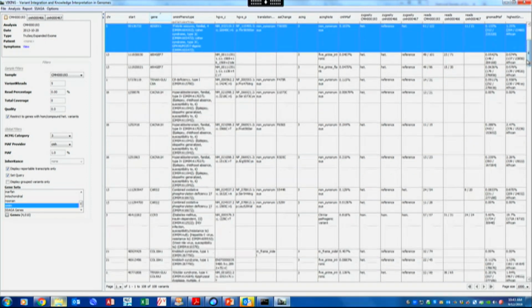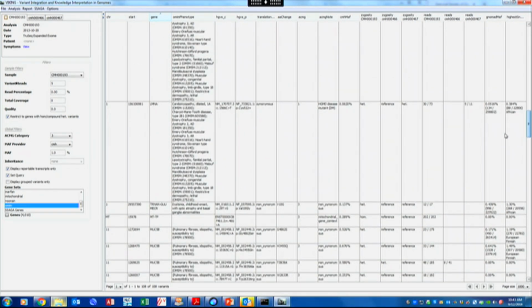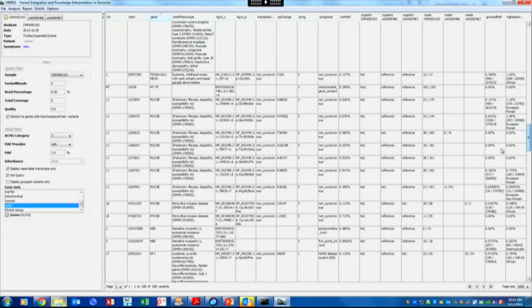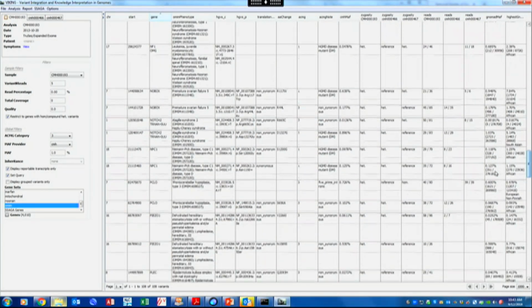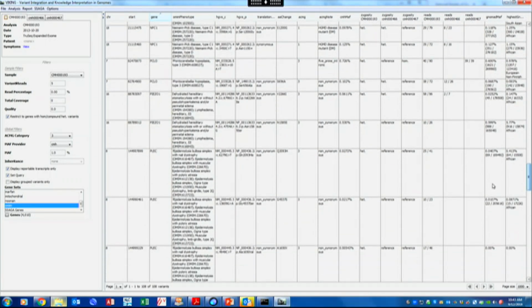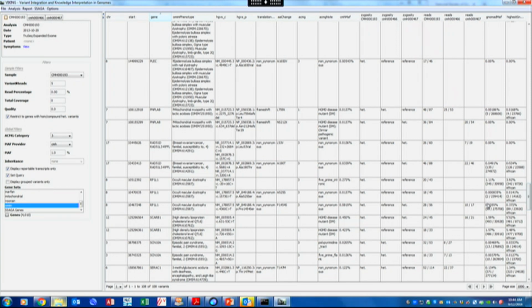So we're going to just keep going down the list. And a nice thing to do might be to highlight any loss of function variants that you're interested in, like highlight them yellow, and then when you're scrolling down, it'll really come to your attention, oh, here's one that's interesting, and is there another one in the same gene right below it? But I didn't do that, so we're just going to skip down. And so down here, there's one that starts with P, and P. So yeah, I mean, it can be pretty onerous to do an exome.